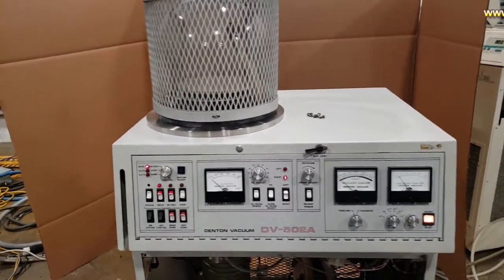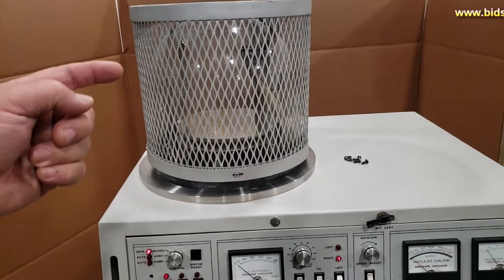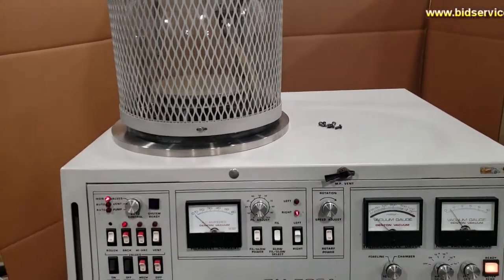This demo here is for the Denton DV502A. Up top here is your bell jar. There are some screws on here that go to the front panel, but I have the front panel open so I can show you underneath.